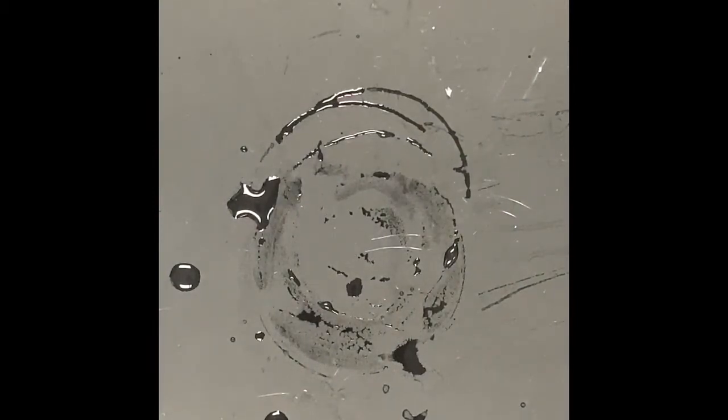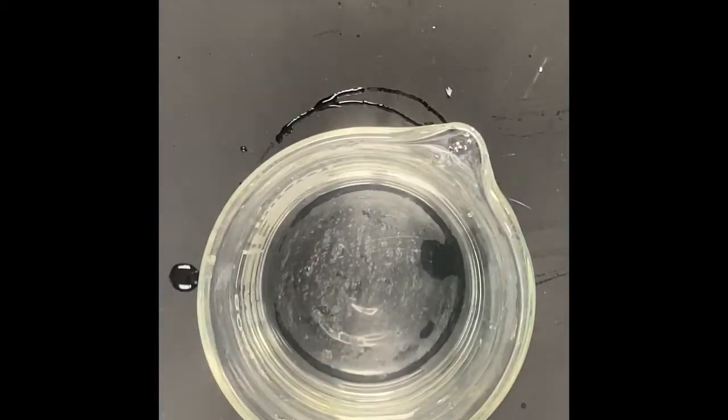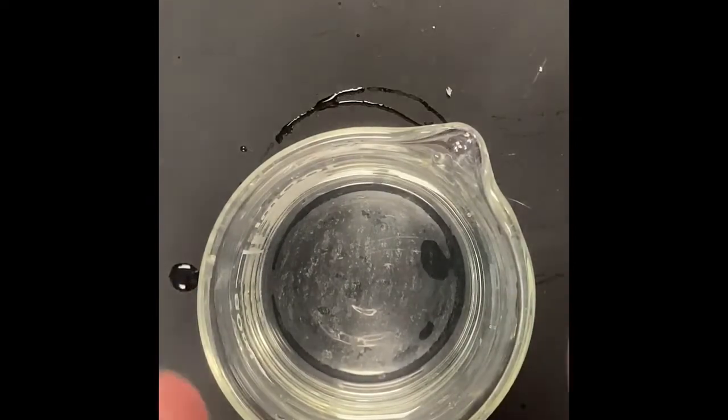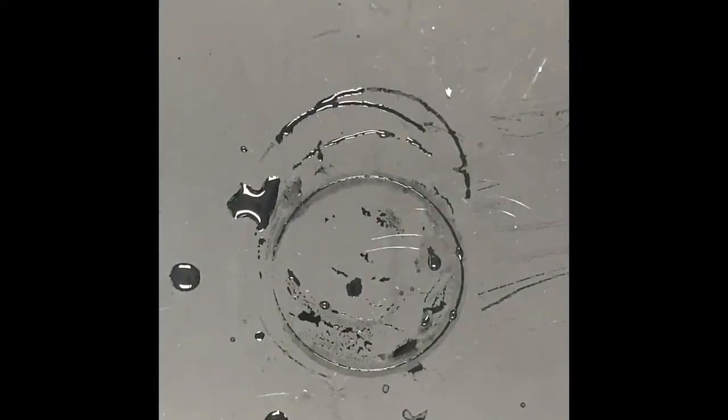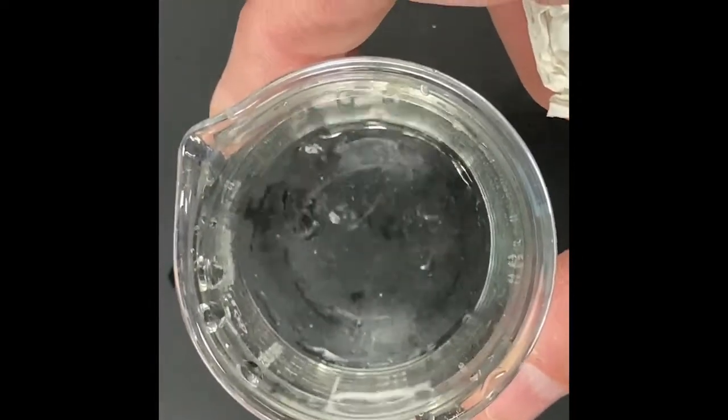So first up, here is what calcium chloride looks like now that it has set for a moment. Okay, that is calcium chloride. Next up, we have citric acid. That is our citric acid.